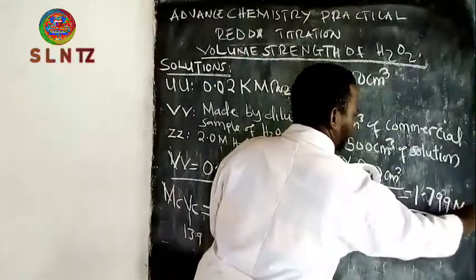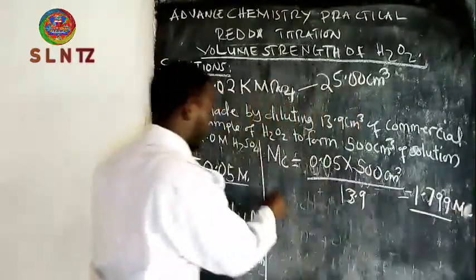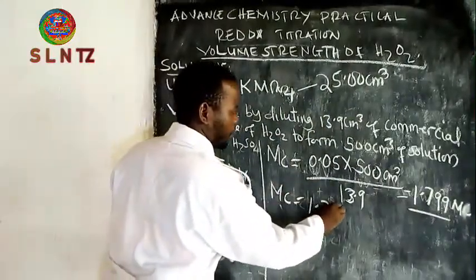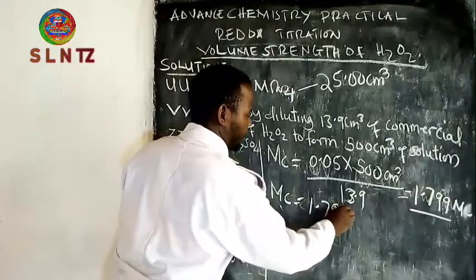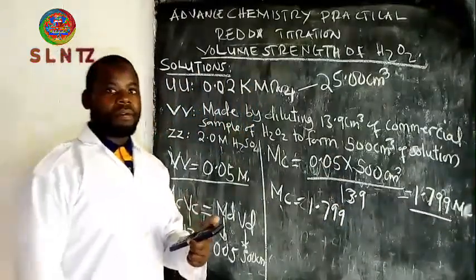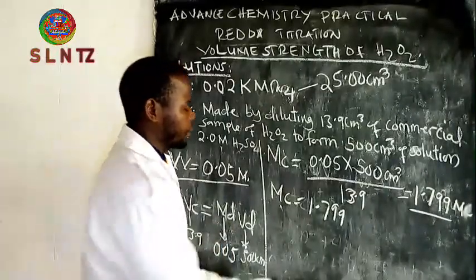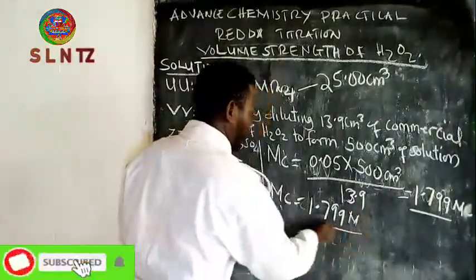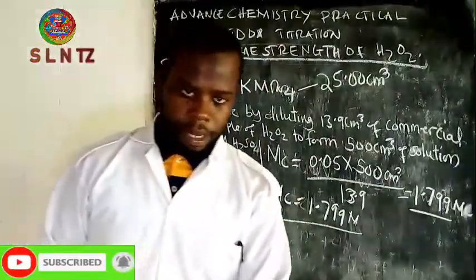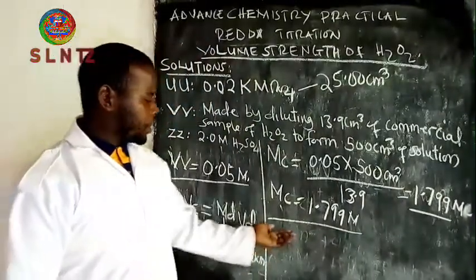That is MC. So MC is 1.799 or 985. That is the commercial molarity.